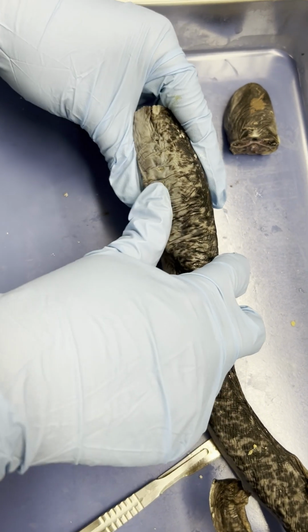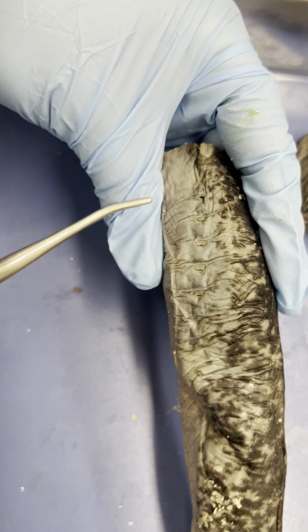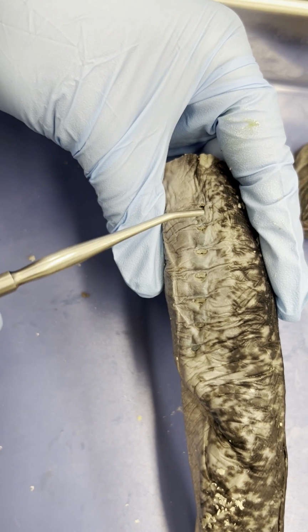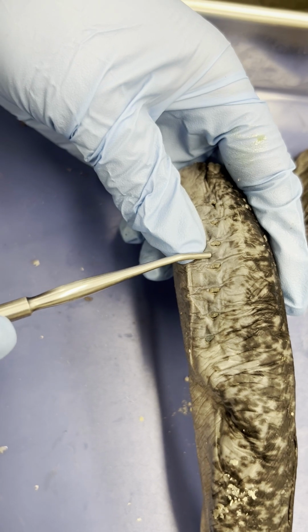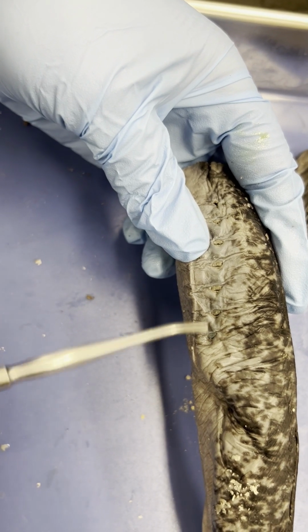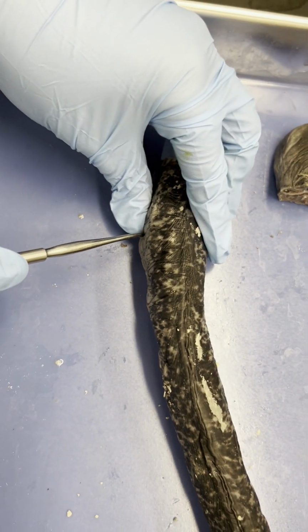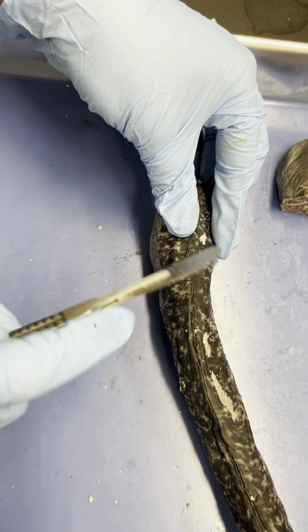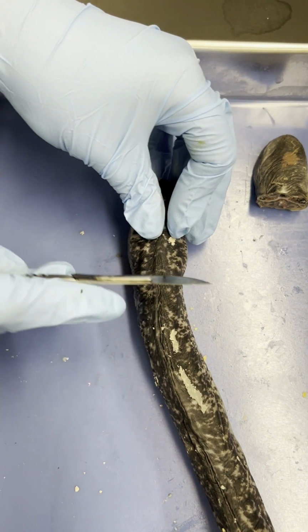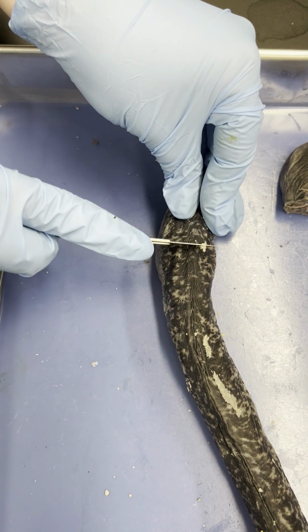So that's where we want to go between our third and fourth gill slits. So again, let's count, make sure. 1, 2, 3, 4. So we think we're in there. 5, 6, 7. So we're going to cut right in this spot. And I'm just going to keep my finger there while I get my scalpel together. Obviously move your finger before you use your scalpel blade.